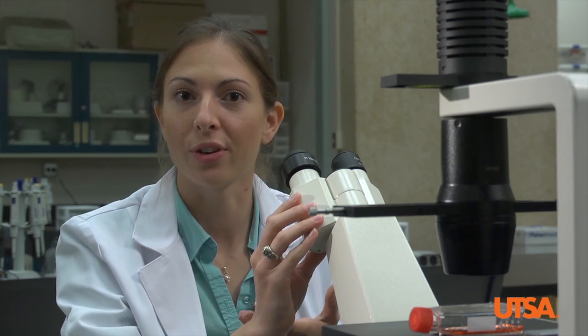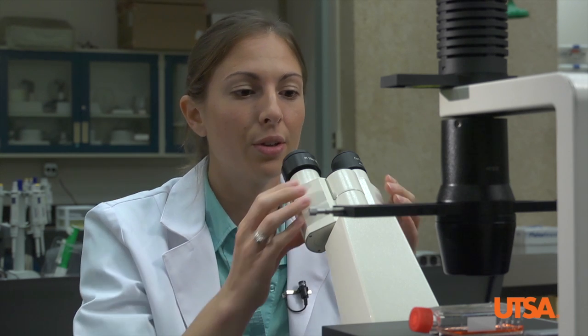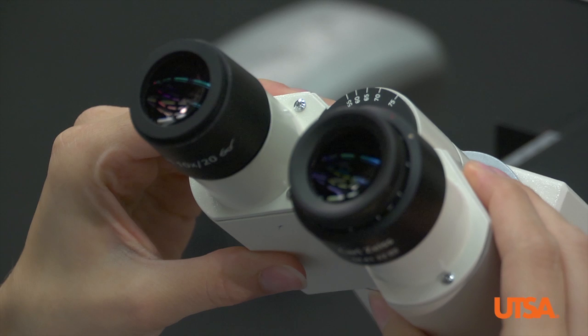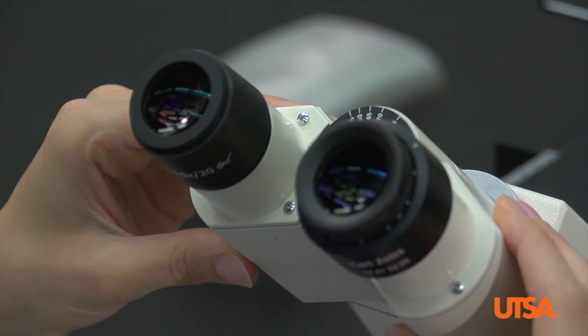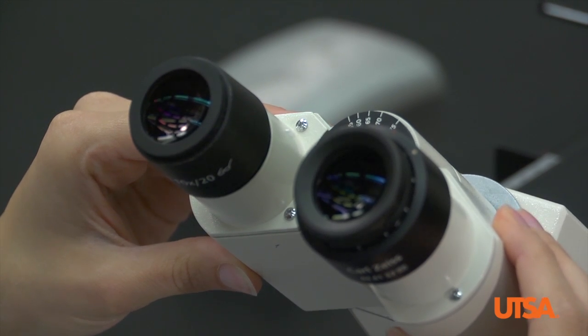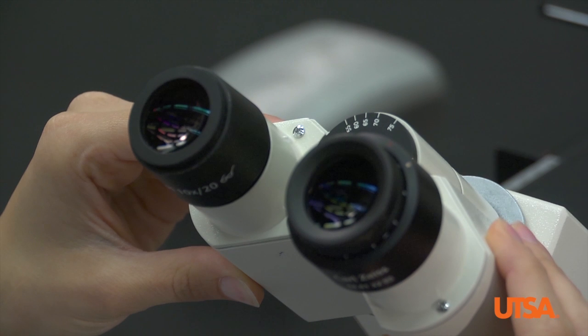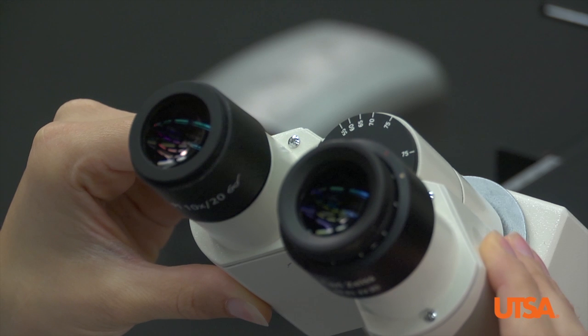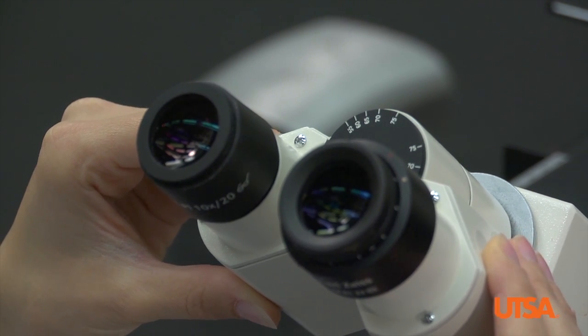The next step is to adjust the binocular tubes to fit your eyes specifically, since all our eyes are set apart at different lengths. Place your eyes within about an inch of the eyepiece, spread apart the binocular tubes, and slowly bring them closer together until the double vision you see becomes one clear image. Once you find that image you can stop moving the binocular tubes.